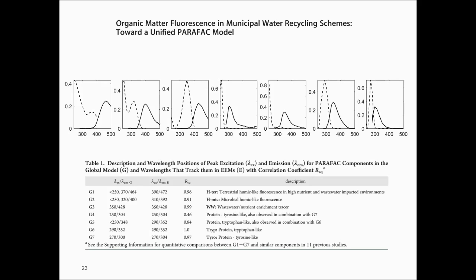So in case you are running a wastewater treatment facility and you are interested in online monitoring in real time, you can use this knowledge and describe your system using fluorescence spectroscopy and PARAFAC to see if you can find similar components, and if you do, you might be able to benefit from this knowledge and use components that correlate very nicely with the bulk fluorescence of the EEM to then describe your system in real-time online fashion with simple sensors that are inexpensive and very sensitive.